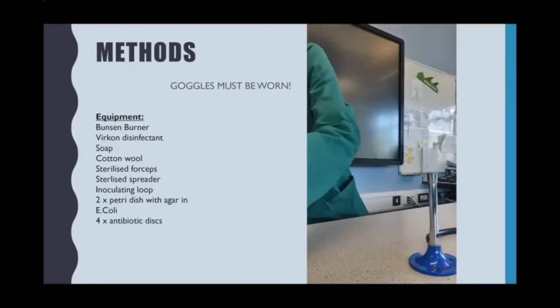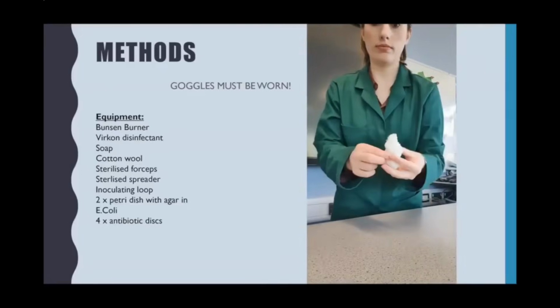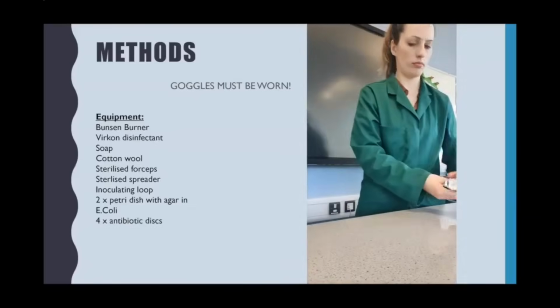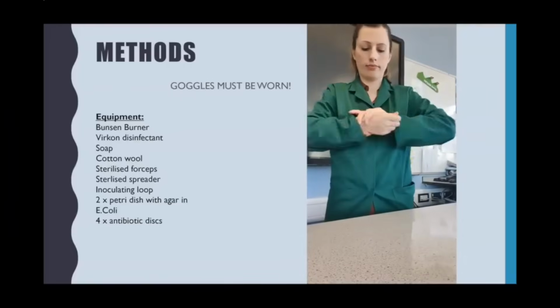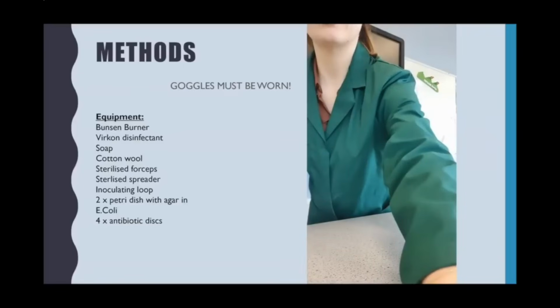The final thing is the post-inoculation sterilisation. So I need to then disinfect the whole workspace again. Put everything away in the bin, and I'm then using my soap, and that was actually hand sanitizer to clean the hands. So that is the method. As I pointed out, you should have goggles the whole time, and I don't have the syringe on that list.